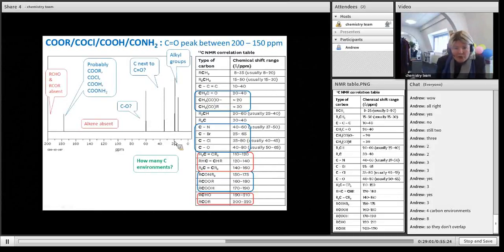Oh, I see. You were looking at these little ones over there. And no. These are what we call decoupled peaks, and sometimes you see something like this, because one way when you do NMR in more detail is the computer can work out the area under the peak. They use calculus, and that will correspond to the number of atoms actually present. Remember, I said the height of the peak doesn't matter. It's the area under it that does matter. And so it's sort of just thickening out a bit. They've decoupled it to remove that area bit.